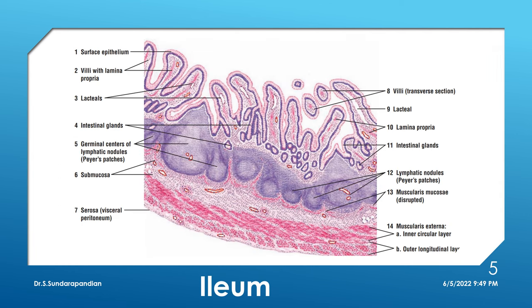Next is the slide of ileum. Here also you can make out all four layers of GIT: mucosa — consisting of lining epithelium, lamina propria, and muscularis mucosa — then submucosa, muscularis externa, and serosa. The striking feature of ileum is that in the lamina propria you can make out numerous lymphatic nodules.